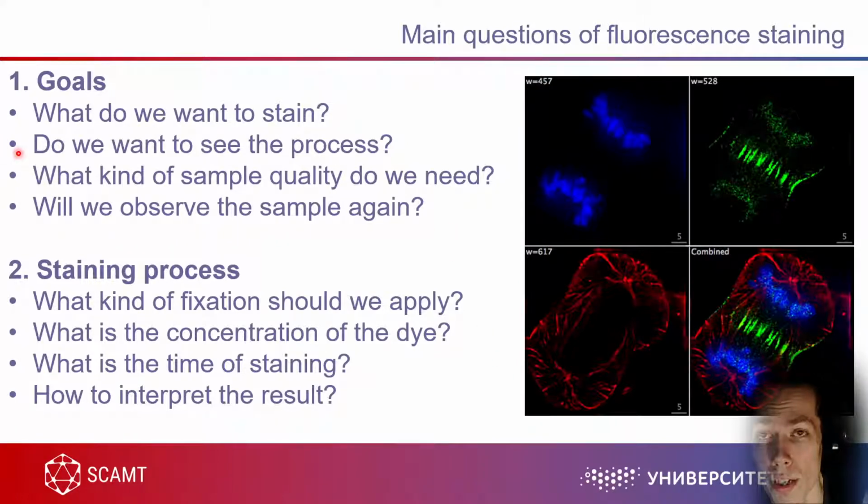The next question is, do we want to see the process? Because here we see a process, but this is just an image, and this is probably an image of a fixed cell. But you can also see some process, for example, of endocytosis, so how the cell takes up your particles. You can observe this in real time with, for example, lipophilic staining of the membrane. So you will see how the pseudopods are forming and how they take up your nanoparticles and incorporate them inside the cytoplasm. So even process visualization is available now.